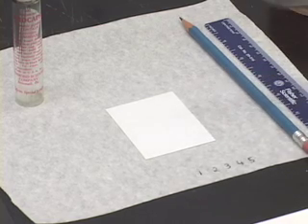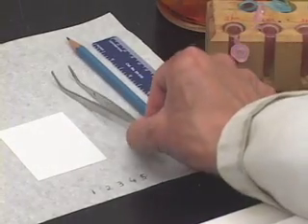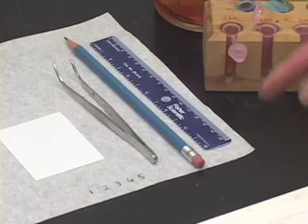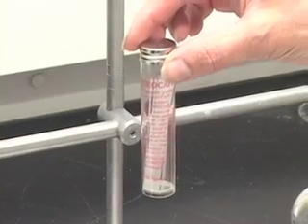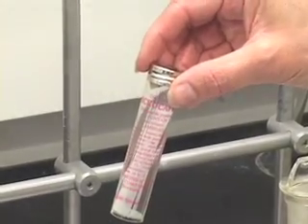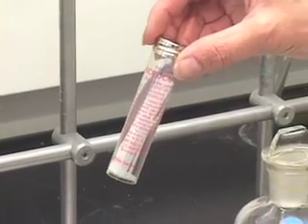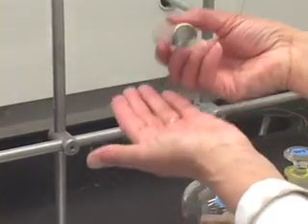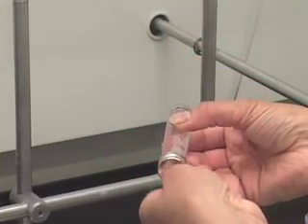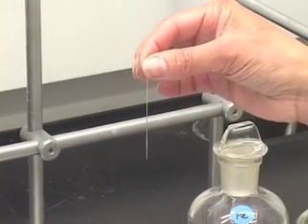We also need tweezers to handle the TLC plate. You need a pencil, a ruler, and capillary tubes. These are very thin glass tubes which are hollow inside. Let me take one out and show you what it looks like. This is how fine this capillary tube is.